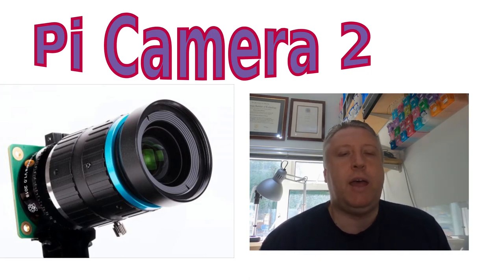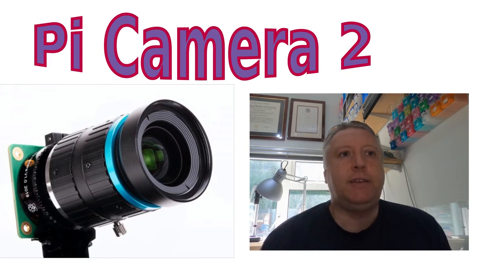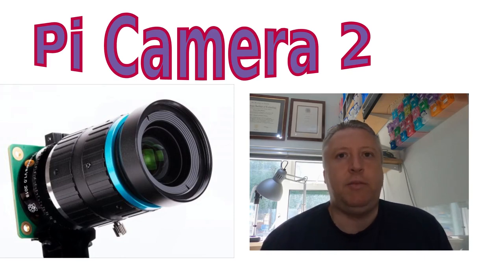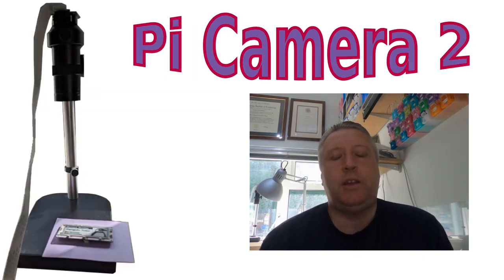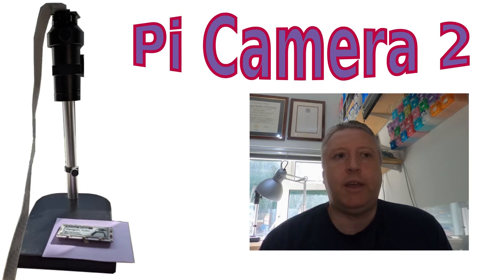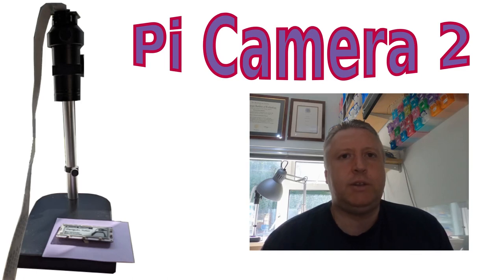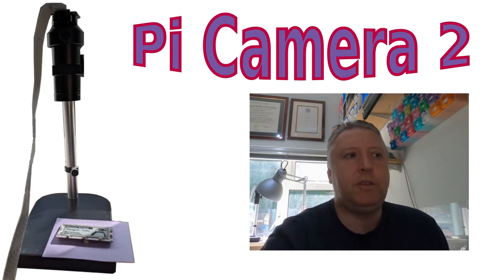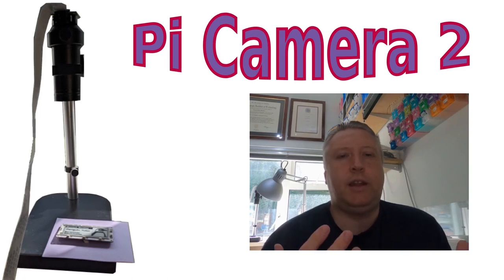In this I'm going to provide an introduction to the new camera library using a Raspberry Pi 3 and an official HQ high quality camera module. In my case the camera is attached to a microscope lens. It will also be the same for the other Raspberry Pi cameras, although it's the high quality camera that needs special consideration due to the memory usage, which I'll explain later.